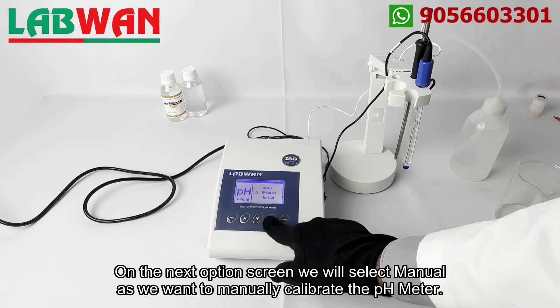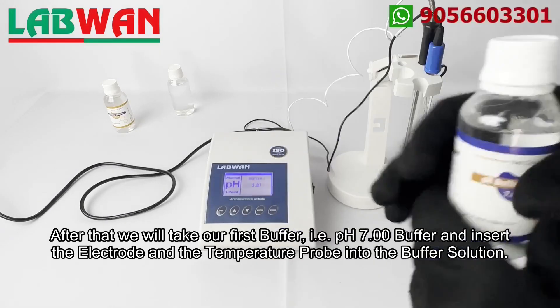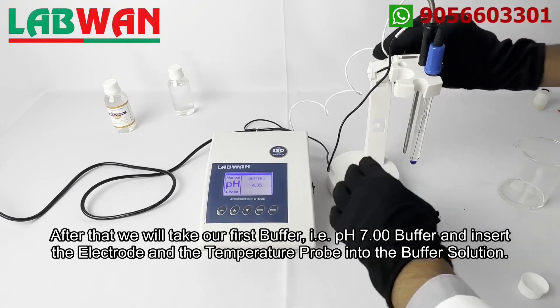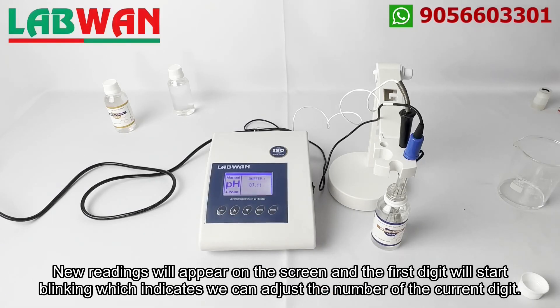On the next option screen we will select manual as we want to manually calibrate the pH meter. After that we will take our first buffer, that is 7.00 buffer, and insert the electrode and the temperature probe into the buffer solution. New readings will appear on the screen and the first digit will start blinking, which indicates we can adjust the number of the current digit.